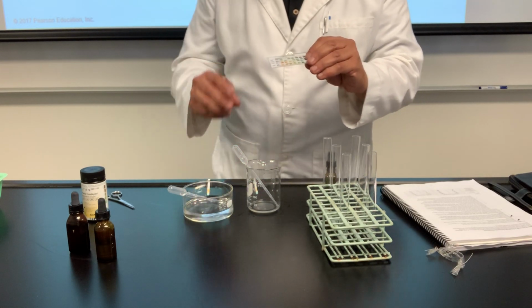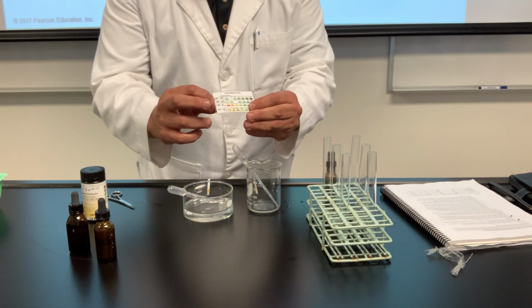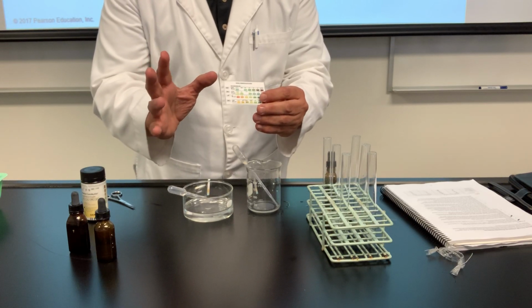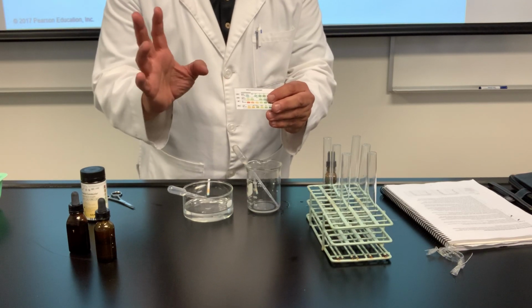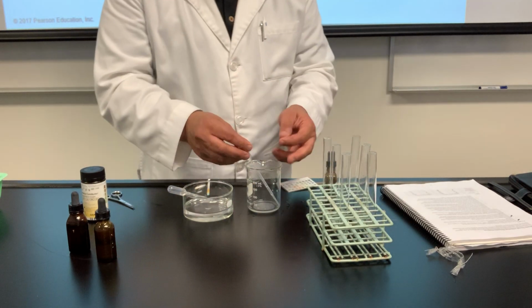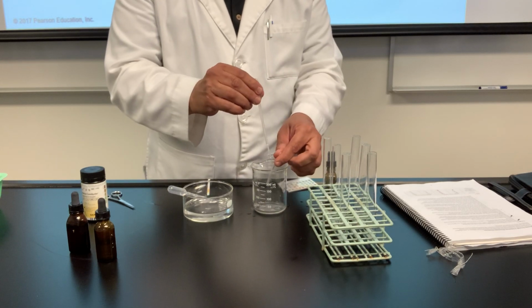Look at that. It's testing for glucose, for protein, pH, and the presence of blood. Well, we don't care about pH and blood. So you can use this for so many different things, but in this case, all we're looking for is glucose and protein. And all we have to do is soak this with the solution. So this one is going to be my inside solution.